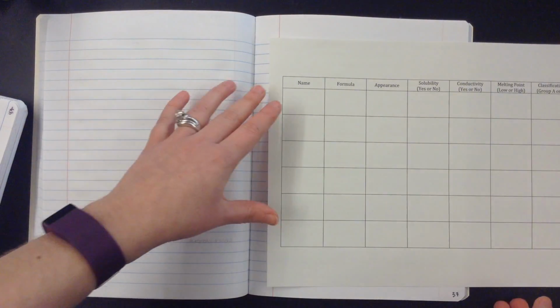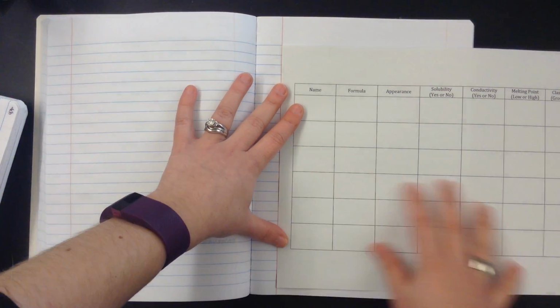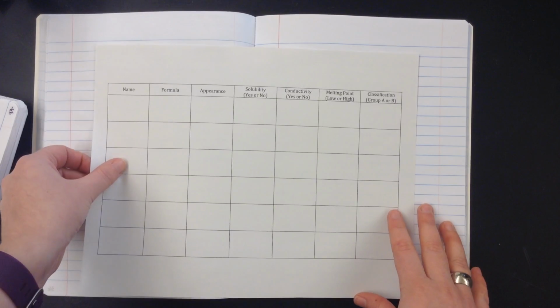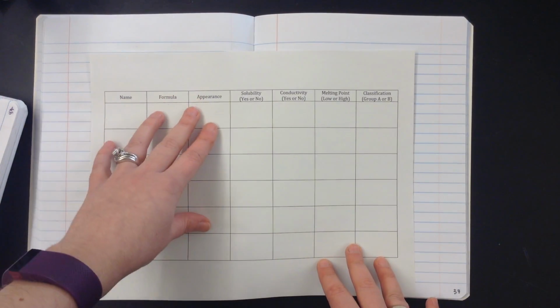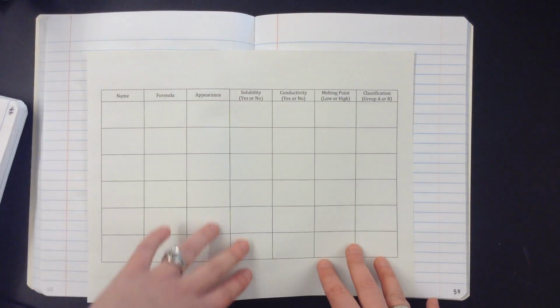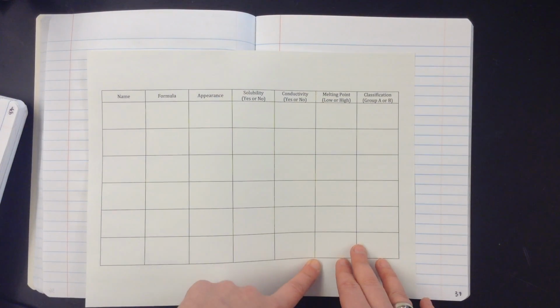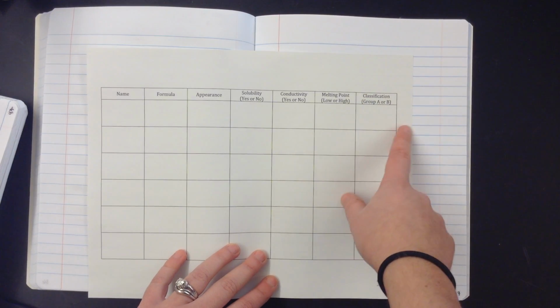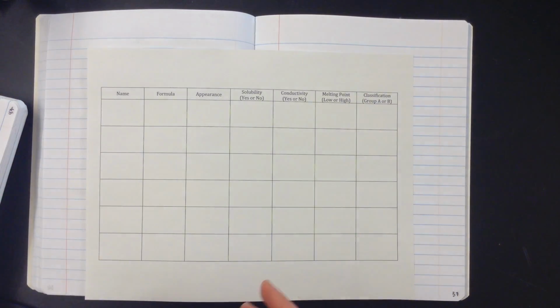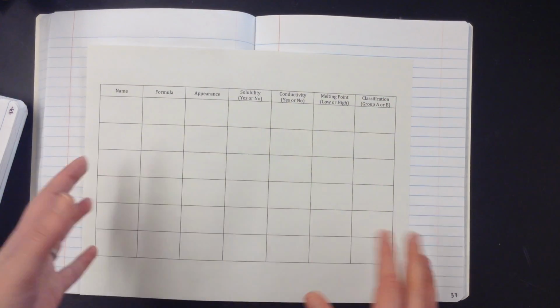So we have provided your data table for you. We're going to put this in similarly to how we put it in for the types of elements. So it's a full page that has all the different categories. You have the name of your compound, its formula, and then the different tests that you're going to run. So its appearance, whether or not it's soluble in water, whether or not it conducts electricity, whether it has a high or low melting point, and then you're just going to arbitrarily sort them into whether you think they're in group A or group B. At this point, we're not going to differentiate between group A and group B. I just want you to have a space to sort them.